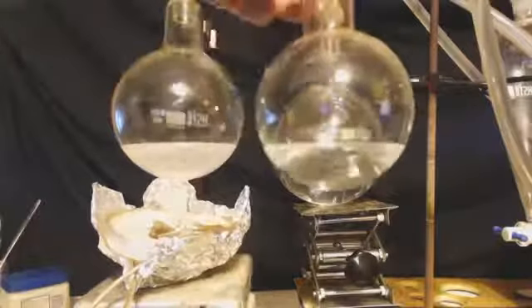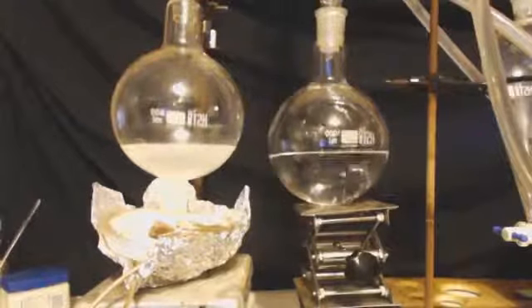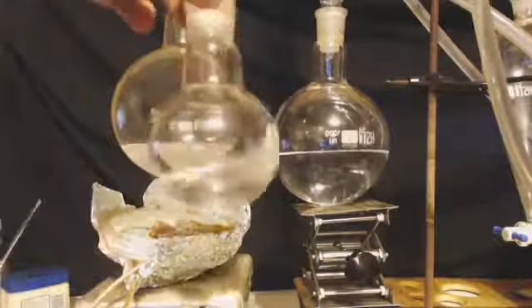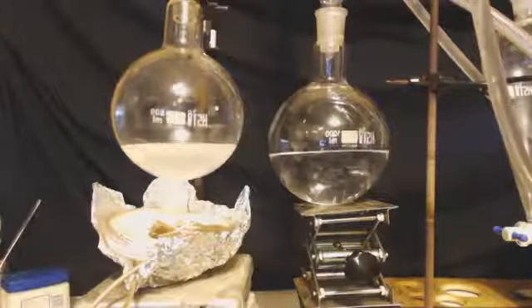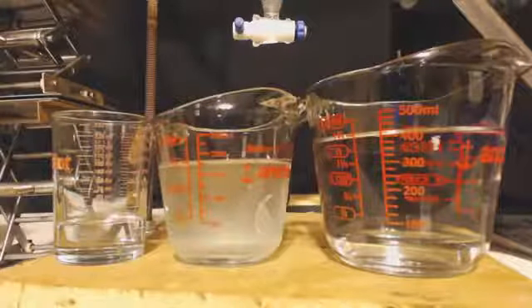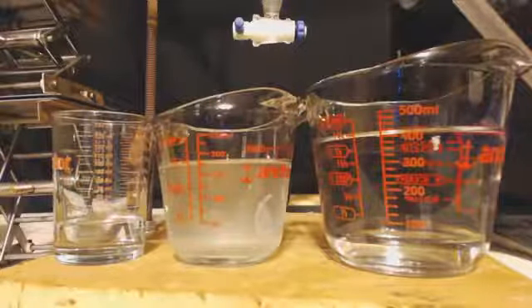So there's the end. There's on my hand, that's the first distillation I did. Has the high boiling point stuff in it. To the left there is the second one where all the high boiling points, and to the right is the azeotropic from both of those. This little flask here was the low boiling stuff I boiled off, which is about 30 milliliters. I'm going to dump everything out and get exact measurements here. Low boiling point's 29 milliliters to the left, then high boiling point 180 milliliters, and then the azeotrope to the right, which is 420 milliliters.